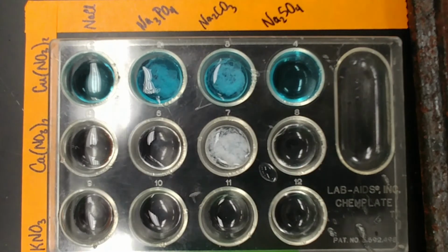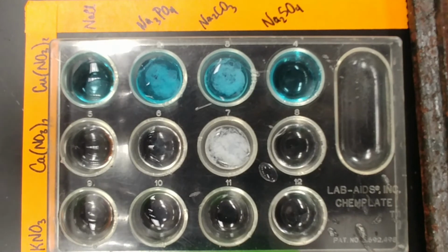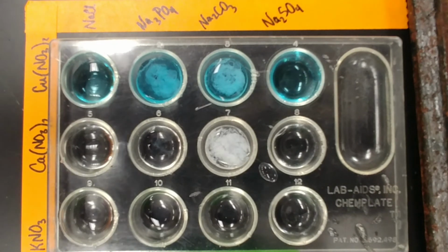And there we go. Kind of shield the top lighting so you can see a little bit better. So we are looking for which combinations of reagents are giving us a solid, some kind of precipitate.